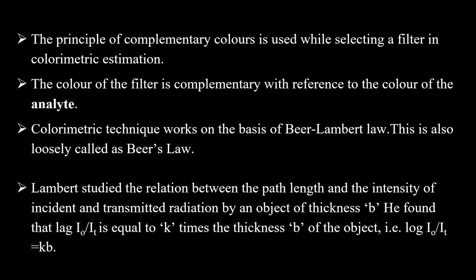The principle of complementary colors is used while selecting a particular filter in colorimetric estimation. The color of the filter is complementary with reference to the color of the analyte, which is to be considered.